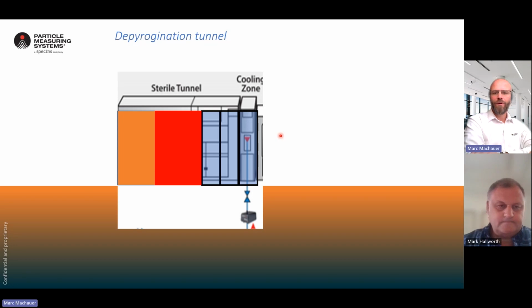So now my tricky last question is, why are we not doing active air monitoring in here? Again, as part of your qualification, you would. So when you have the tunnels in a static phase, i.e. the temperatures are there such that they're not going to denature or overstress microbes, so your biannual qualification of your tunnel, you will be monitoring or demonstrating compliance to your qualification standard.